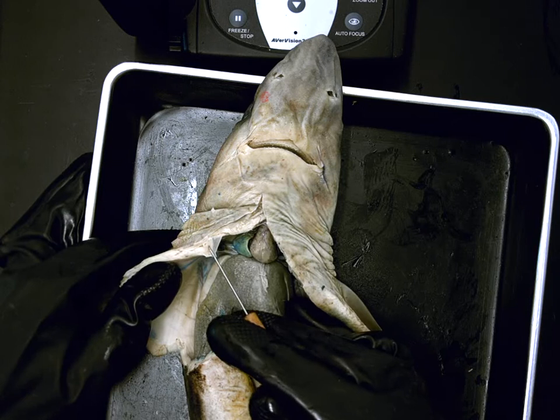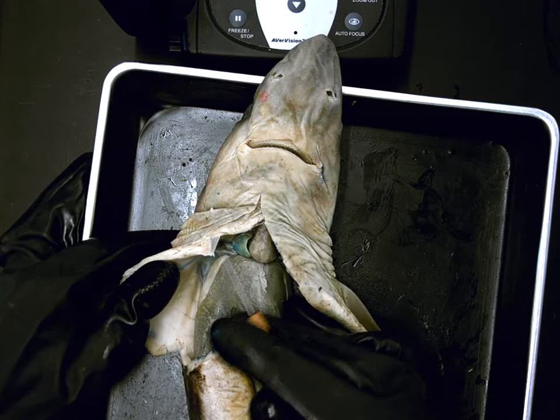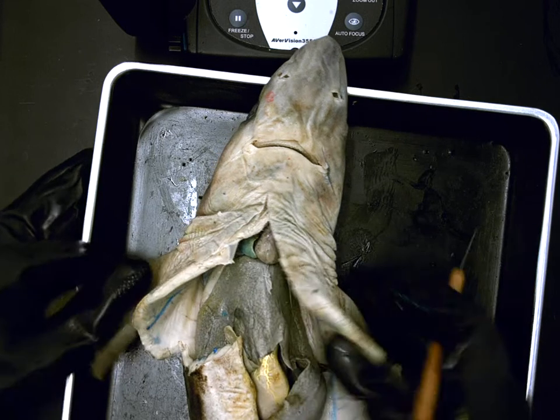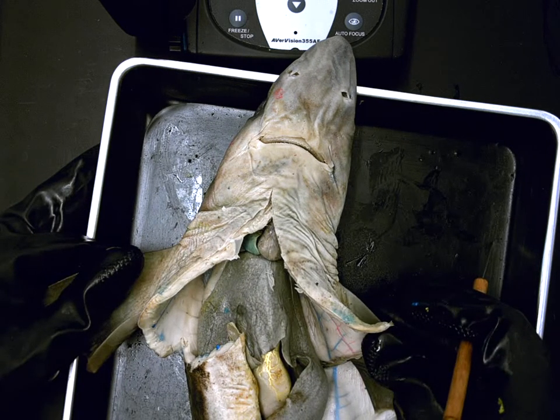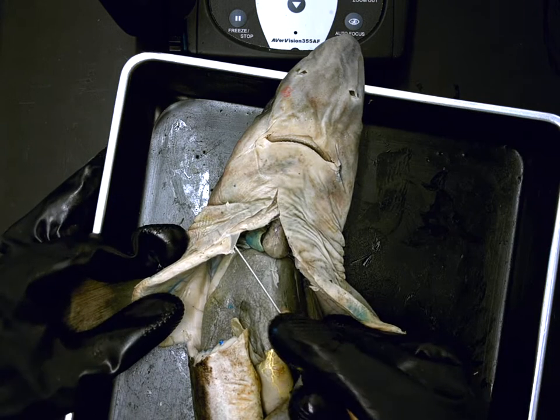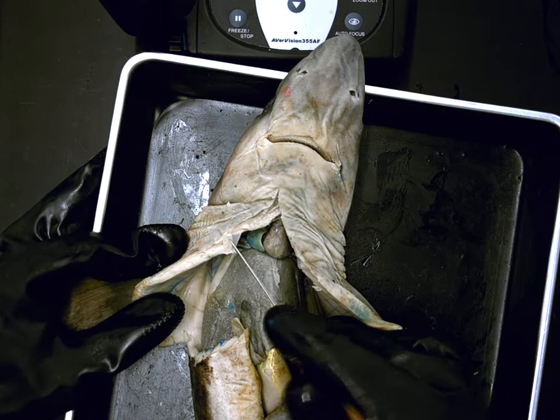What would this white tough stuff be right here? The pelvic girdle. Not pelvic. Oh, sorry. Pectoral girdle. Excellent. Function of the pectoral girdle is? Support the fins. Pectoral fins.